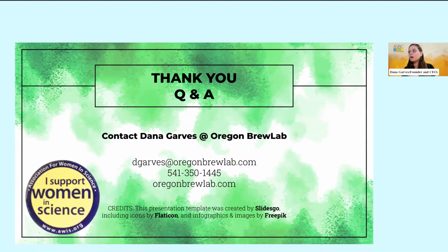So I haven't tried MRS, I haven't tried LMDA. I think there's a few other popular medias that I just haven't tested against, primarily because I hate pulling out my pressure cooker now. But I am so curious. I would love to do a collaboration with any other scientist who wants to look at comparing autoclaved or pressure cooked media to microwaved media.